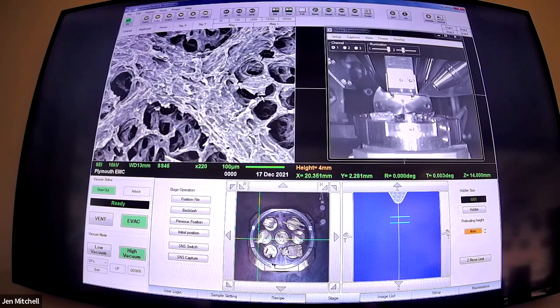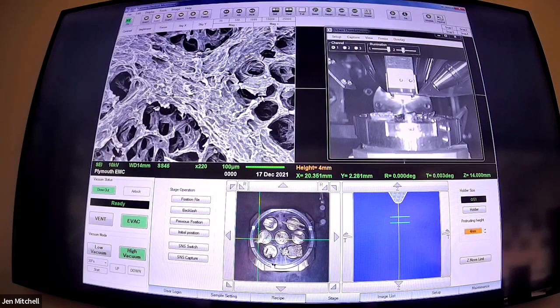One issue I often have with microscopes is that I can't wear my glasses with a mask on. So what I think is in focus may actually not be in focus for people with better eyesight. Even on these spongy bits there's quite a lot of texture. Some of the other samples have texture that I certainly didn't realize was there.